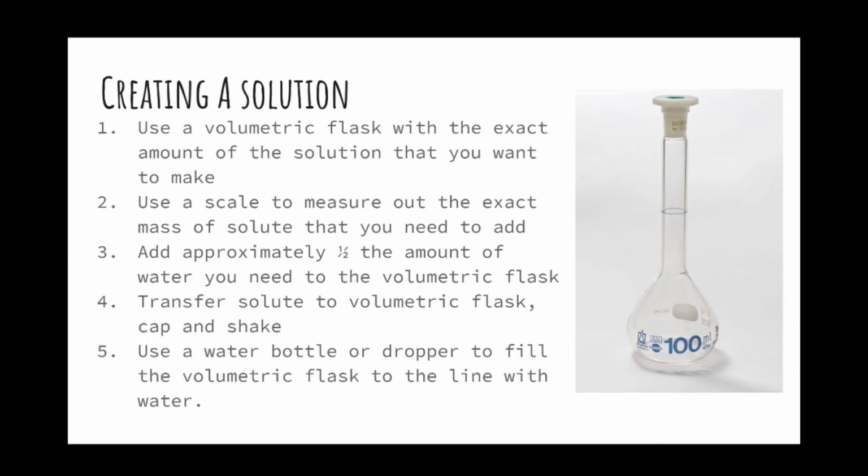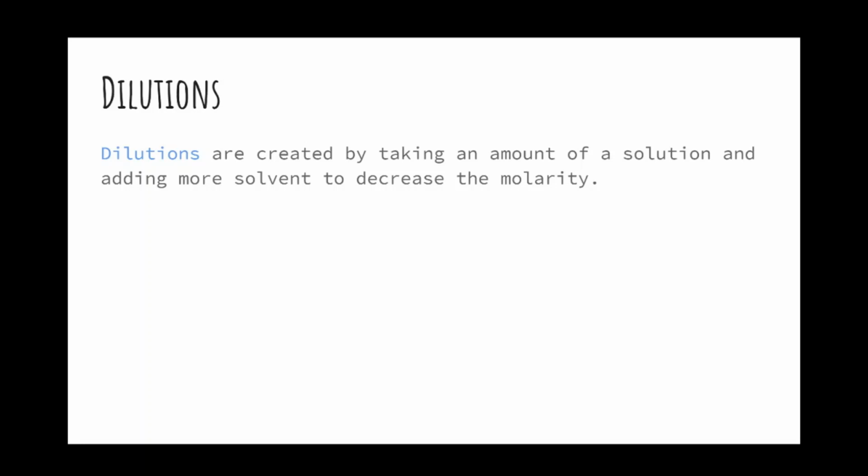Cap it, and then you're going to invert it a few more times. There you go, and you've made your solution. Dilutions. Dilutions are created by taking an amount of the solution and adding more solvent to it to decrease the molarity.